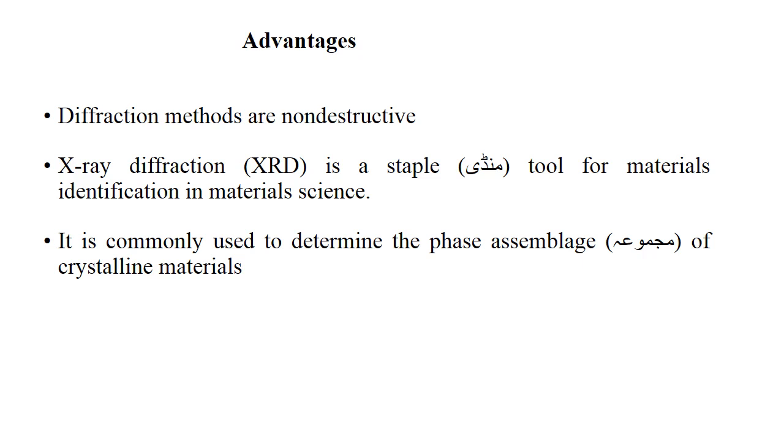Second, the X-ray diffraction technique is a staple tool for materials identification in material science. This technique is also used to determine the phase assemblage of crystalline materials.